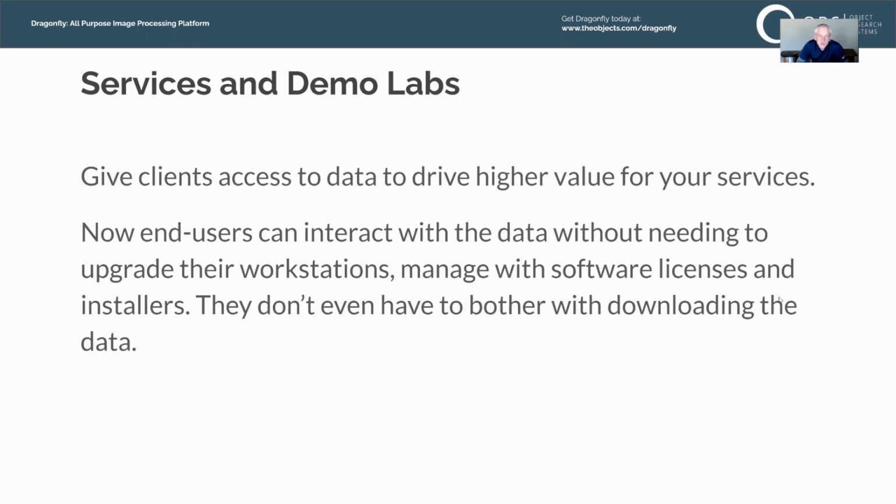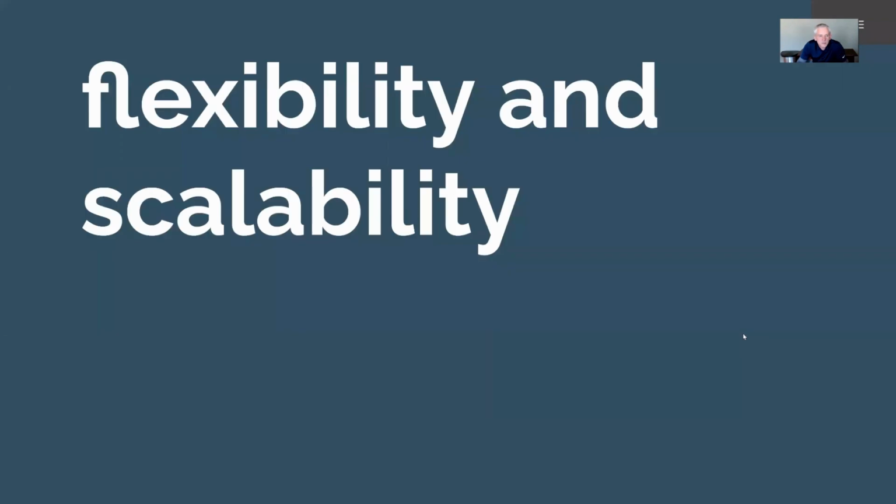Finally, I'll just mention as a use case, services labs and demo labs. You can now give clients access to data in a much better way to drive higher value for your services. Now, with Dragonfly VizServer, end users can interact with their data without needing to upgrade their workstations, without needing to manage their software licenses or deal with installers, and they don't even have to bother with downloading the data. They establish a connection and the data is there and they can open it and process it.